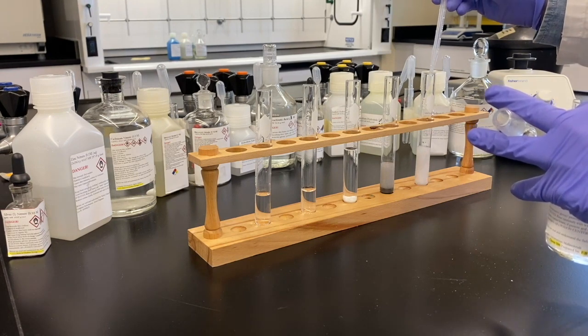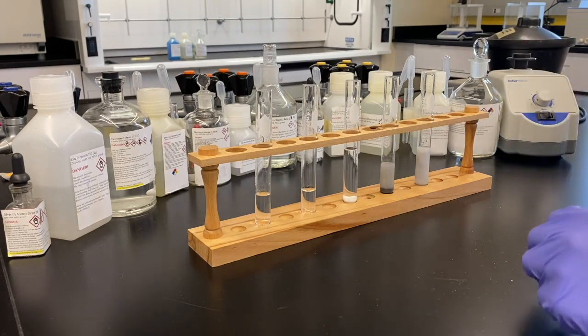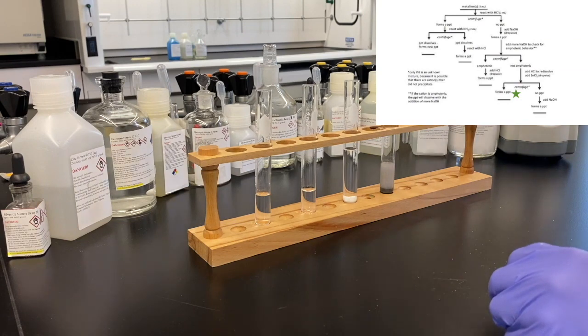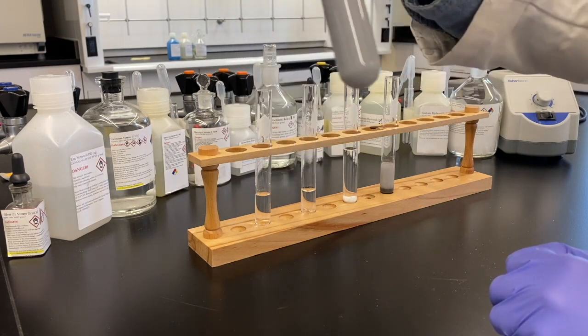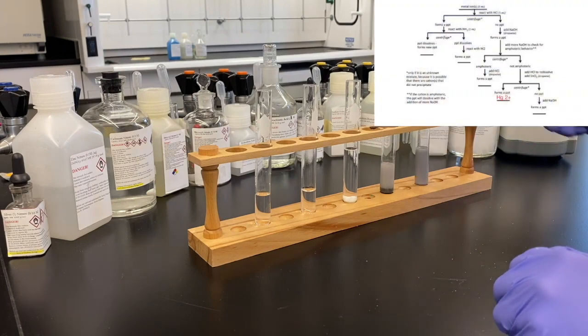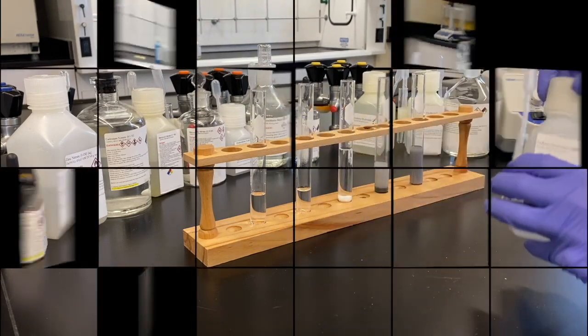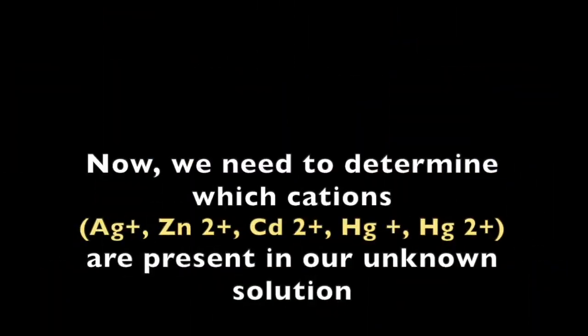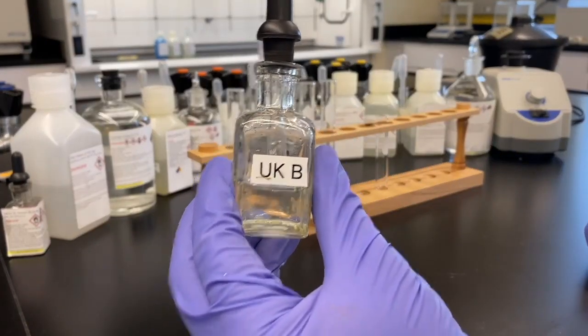Clear reaction. And notice that that actually looks like the same precipitate we saw when we added acid to mercury 1. Interesting. Are you suggesting that could be the same precipitate, or it just looks like the same precipitate? We'll see that it is in fact the same precipitate, although the silvery color of this tells us there's something else present as well. What happens here is actually a disproportionation reaction, where we get back both mercury metal and mercury 1 from that reaction. So it's really more of a mercury color. Both mercury and the white mercury 1 precipitate, yeah.